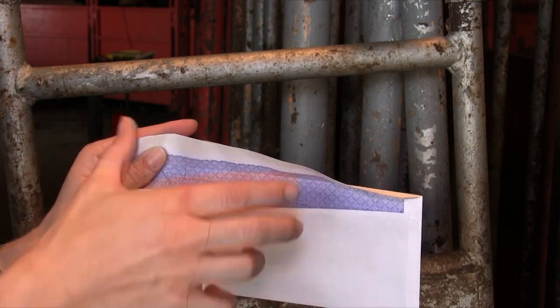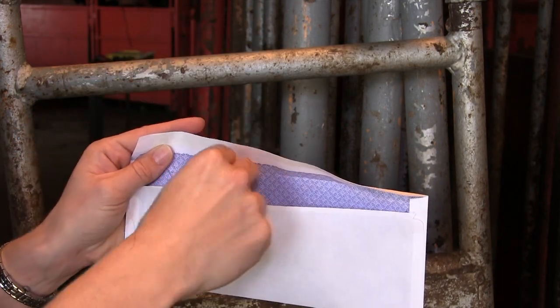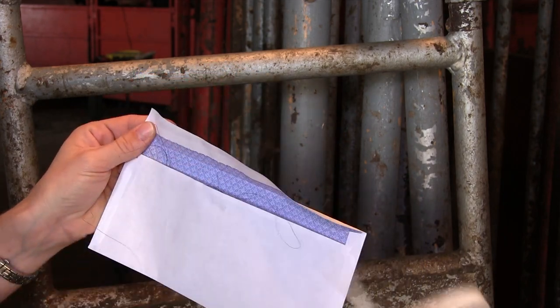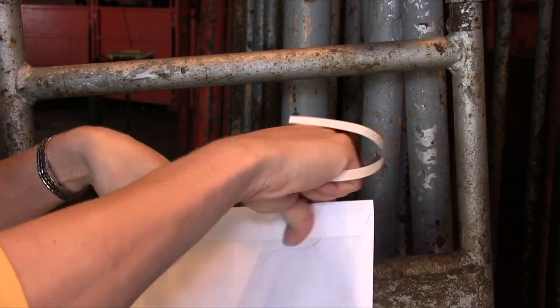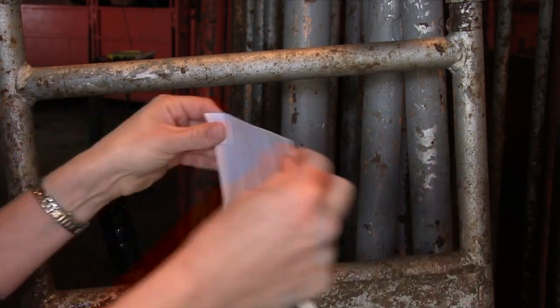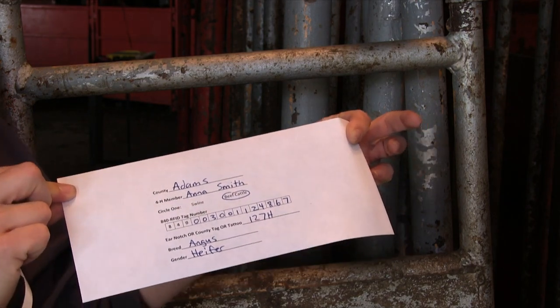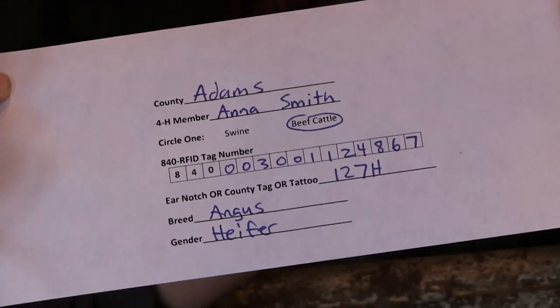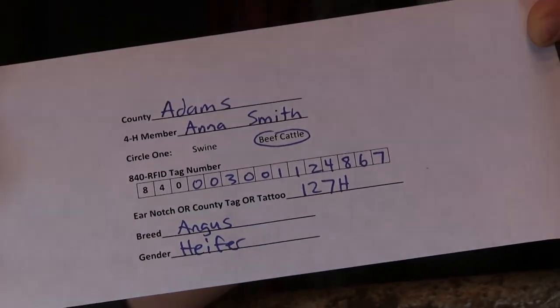The sealed collection envelopes with the information completed on the front should be turned in to your county extension office prior to the deadline for beef cattle ID in 4-H Online. This is April 1st for market steers and May 15th for registered heifers, commercial heifers, and dairy feeder steers. This is required for all beef cattle you want to be eligible for the Indiana State Fair. For specific requirements related to your county-only animals, please contact your county extension office.